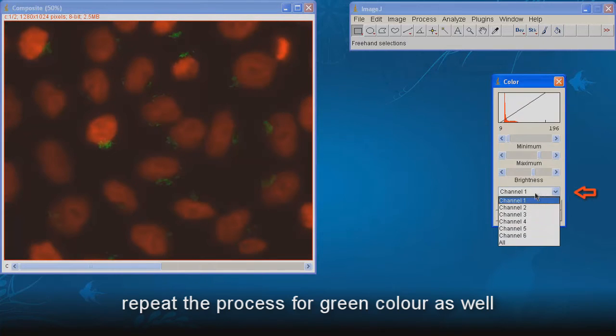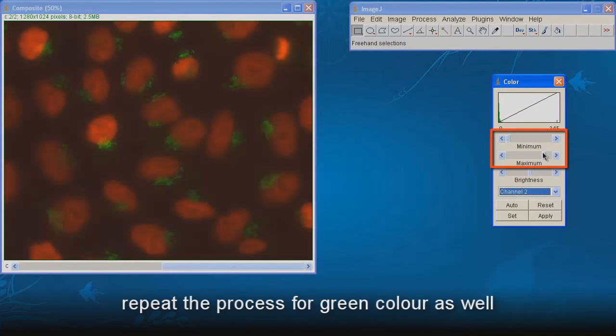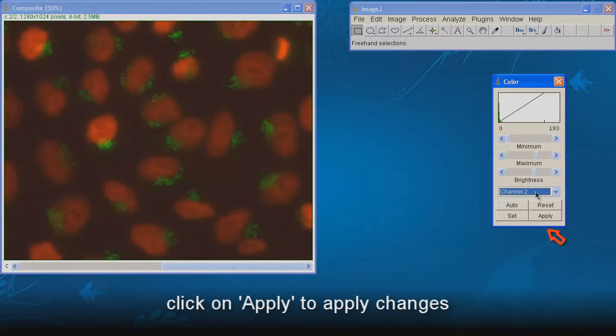Repeat the process for green color as well. Click on Apply to apply changes.